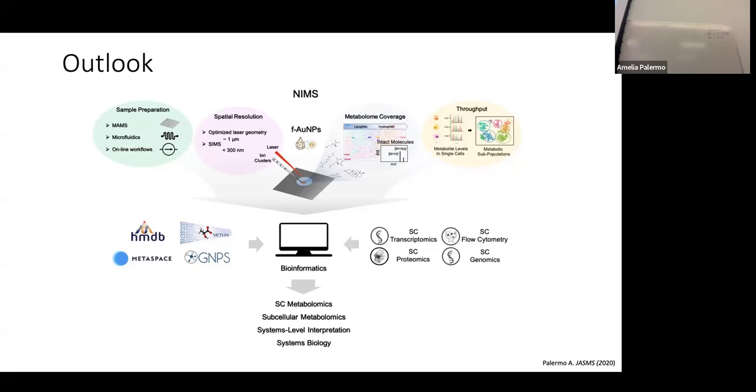Then, of course, for these metabolites, we have seen the pathway enrichment tools. Because we usually work with annotated metabolic features, the most natural first-line way to look into this data is by looking into pathways, because we do not usually have the MS2.